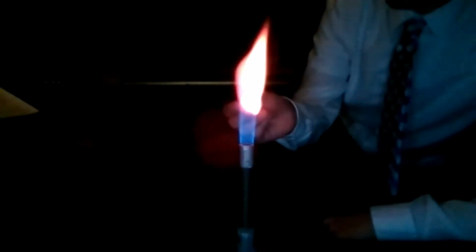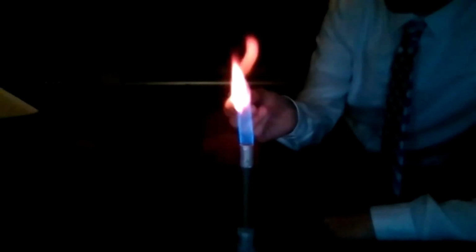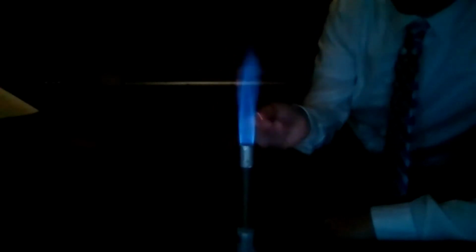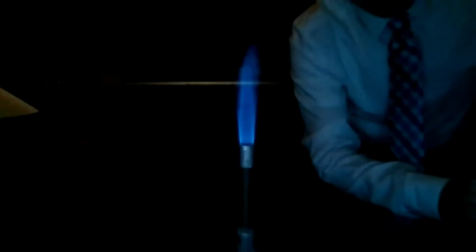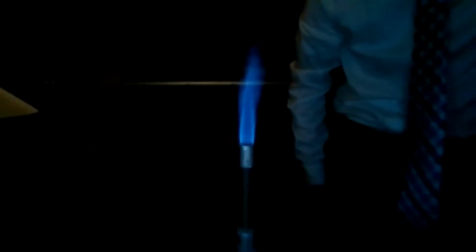Woo. Starting to smoke up over here. What do we want to do next? Wait, was lithium pink? Yeah, it was that pink magenta color.